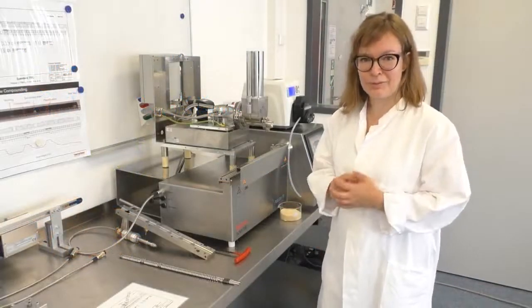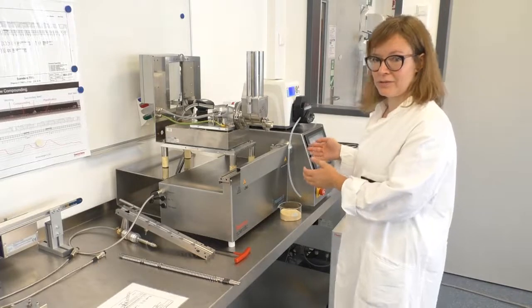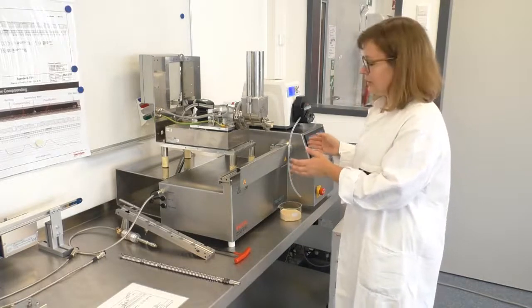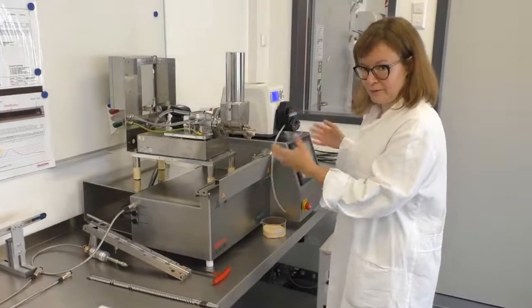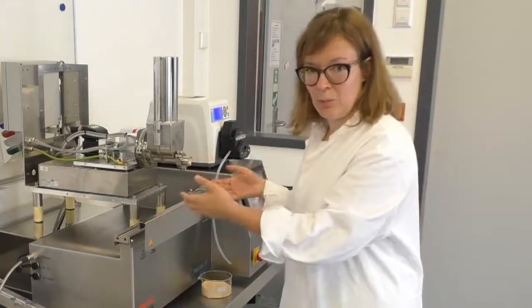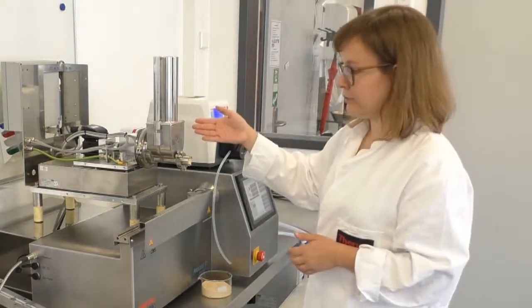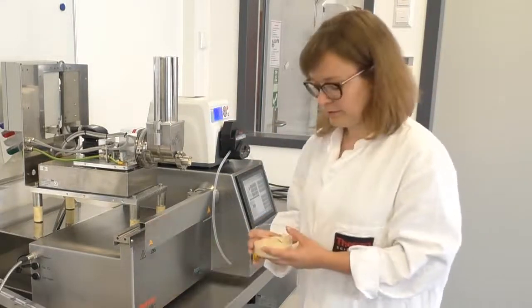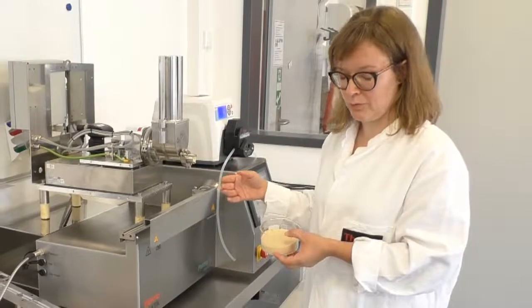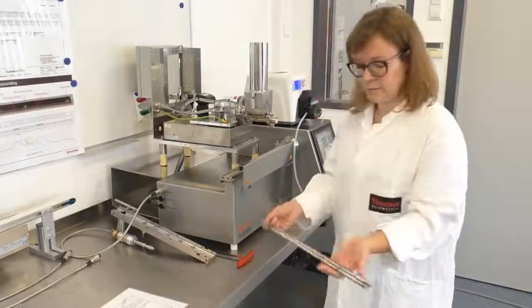Now that we've talked about the principal process setup, I would like to introduce you to the actual hardware that we provide to our customers for this purpose. Of course, the main unit is the Process 11 hygienic twin screw extruder, which is very small and has a very small footprint. You can see here the control panel, and here the main processing unit, which is still open and not assembled yet. Here we have the liquid feeding pump for feeding water, and here a gravimetric twin screw feeder, which is filled with this pea protein powder that will be fed into the extruder during the process.